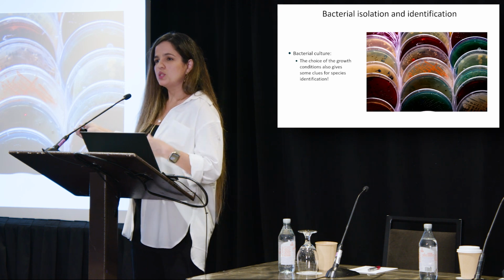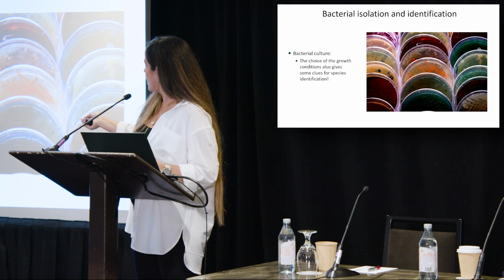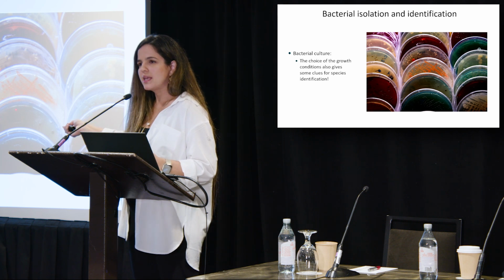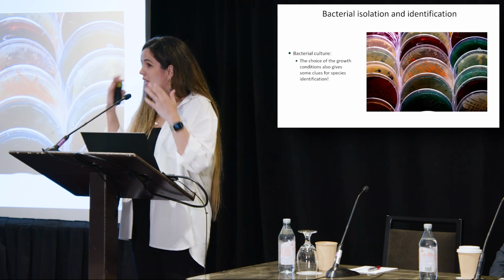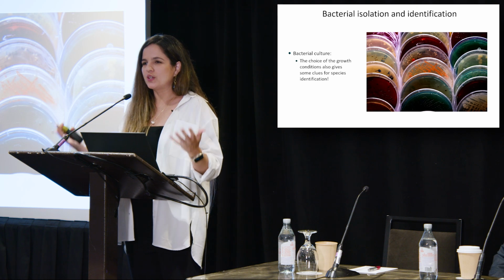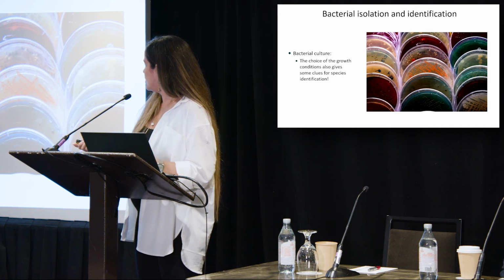This is a very nice example that we have from patients in the lab, right? So we use multiple agars with the same samples from the same patients, and all of these dots over here are bacterial colonies. We call them colonies. They came from a single microorganism that was present in a specific sample. So they grew, and now I can see it. I don't need a microscope anymore to know there is a microbe growing at this specific site.